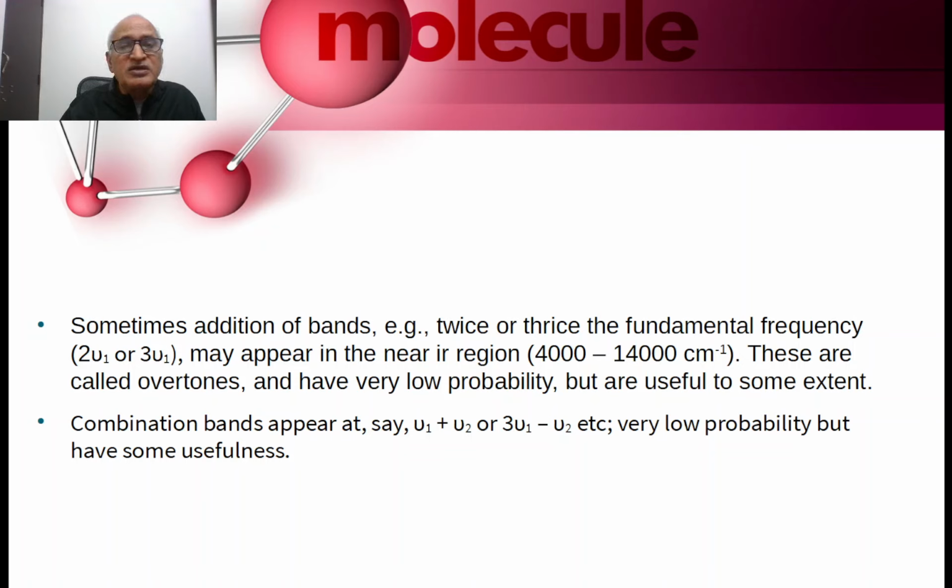Another very important term is overtone vibrations and combination vibrations, combination bands. When we record an infrared spectrum, we get a very large number of absorption peaks. Some peaks are due to fundamental vibrations. Some very small peaks are also due to some other reasons. Then I will explain what an overtone vibration is.